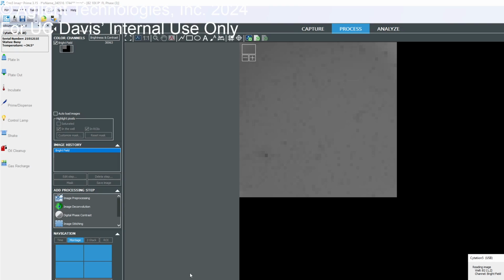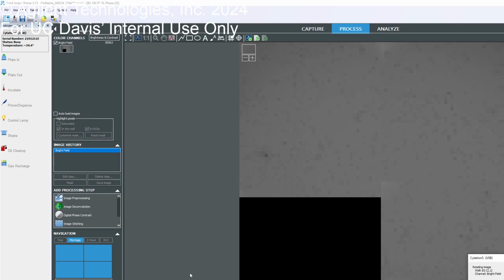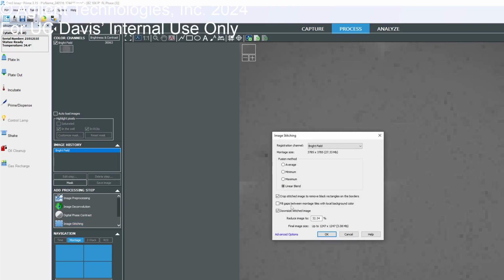Definitely nothing else was open at the time. But we've never tried it on the new software. It might have been something about how it was not moving at the same rates. And you see there is an overlapped region, and that's on purpose. So now it will retain this information and match it, and then it will be able to stitch it. To stitch this image, you have this stitching option there, and just click OK.